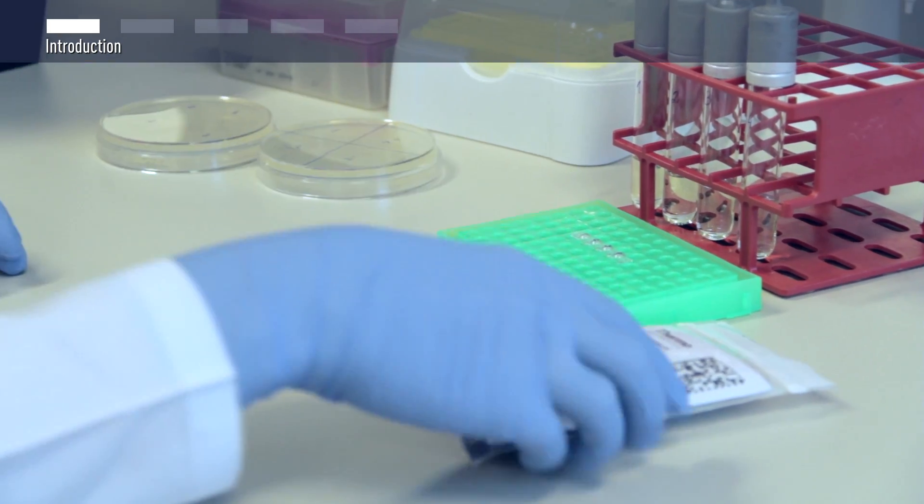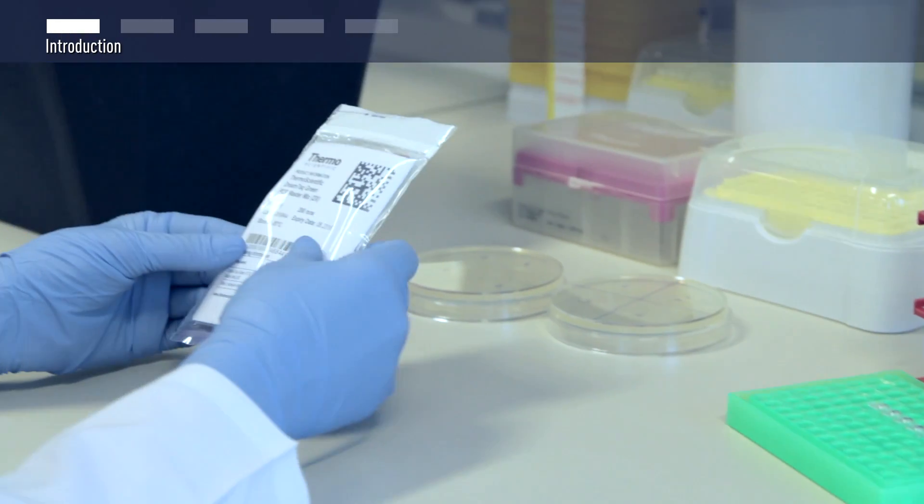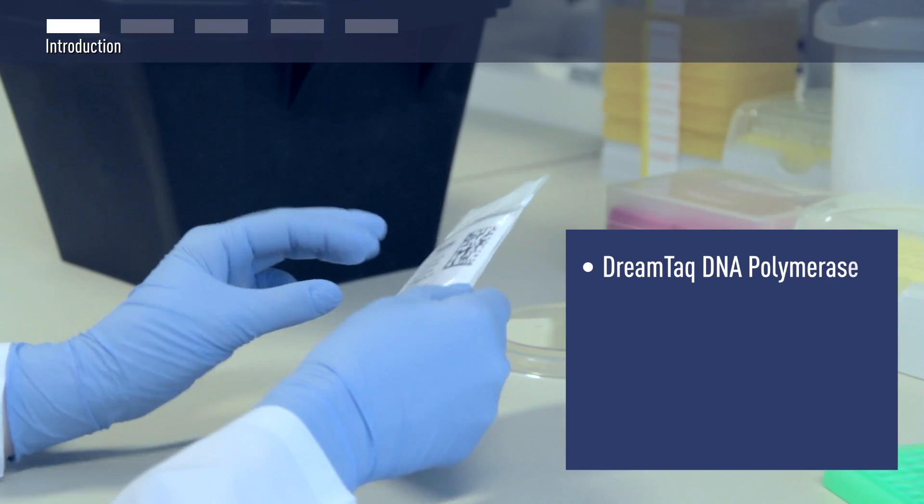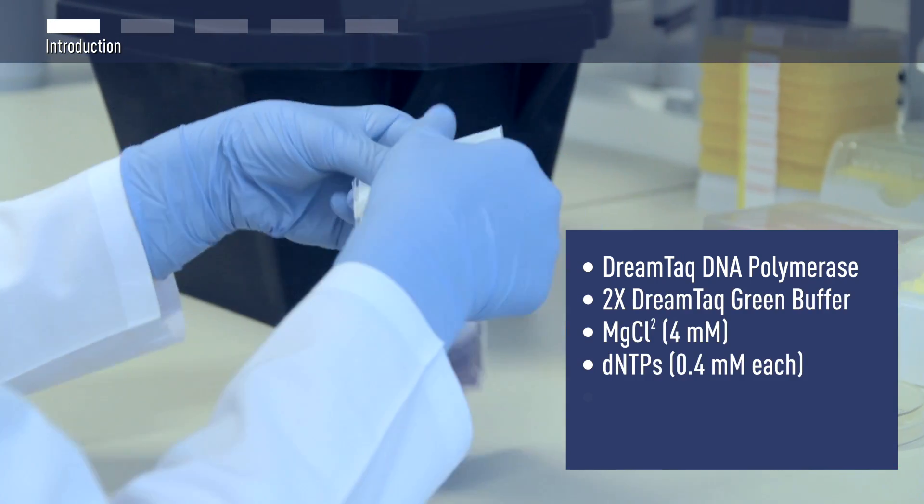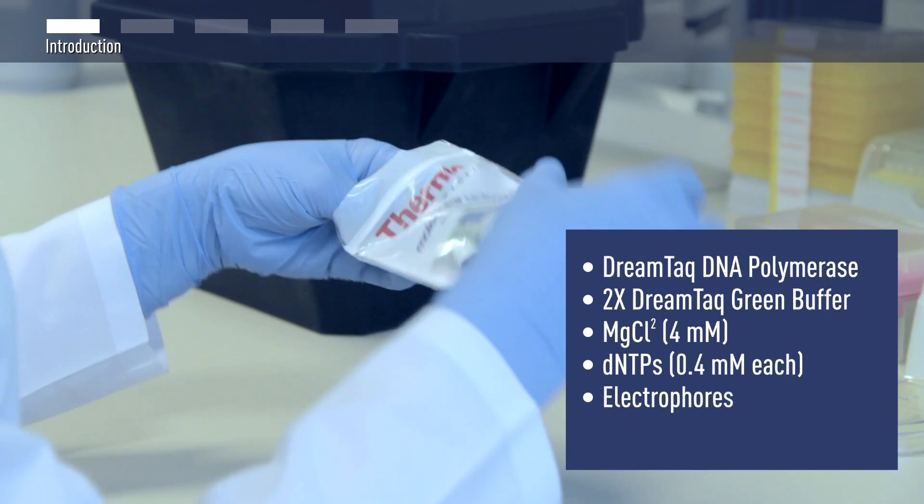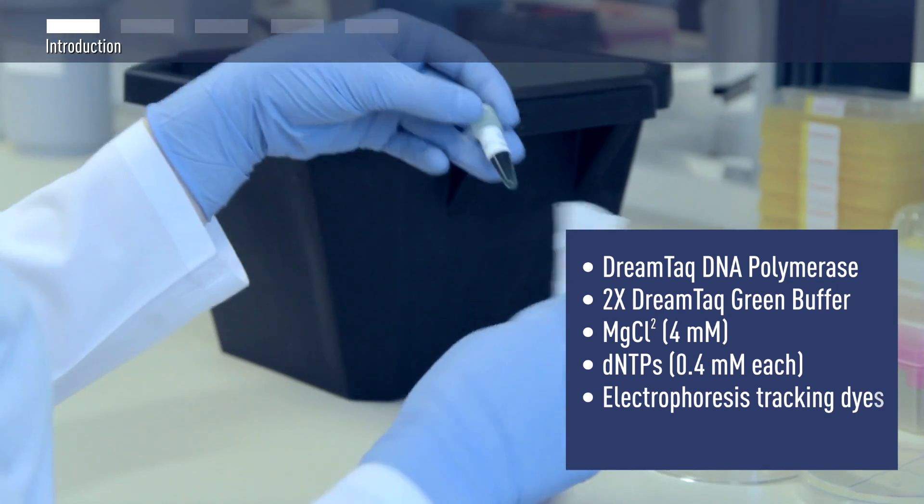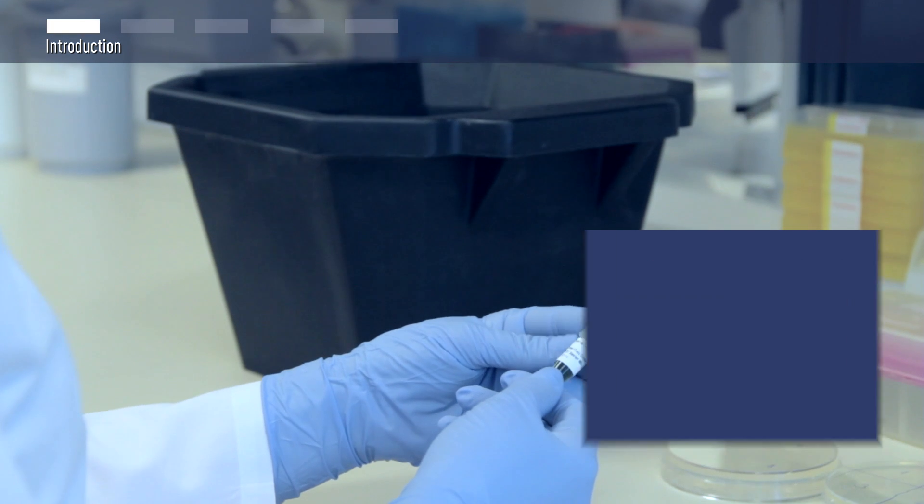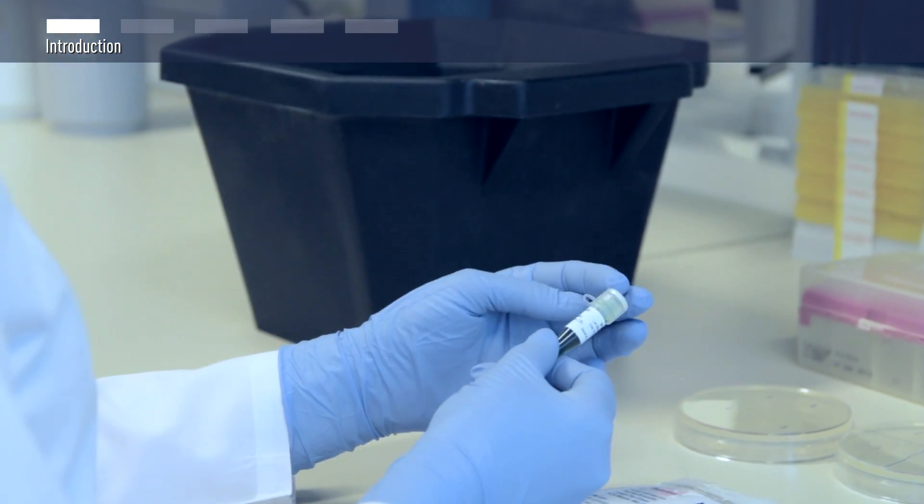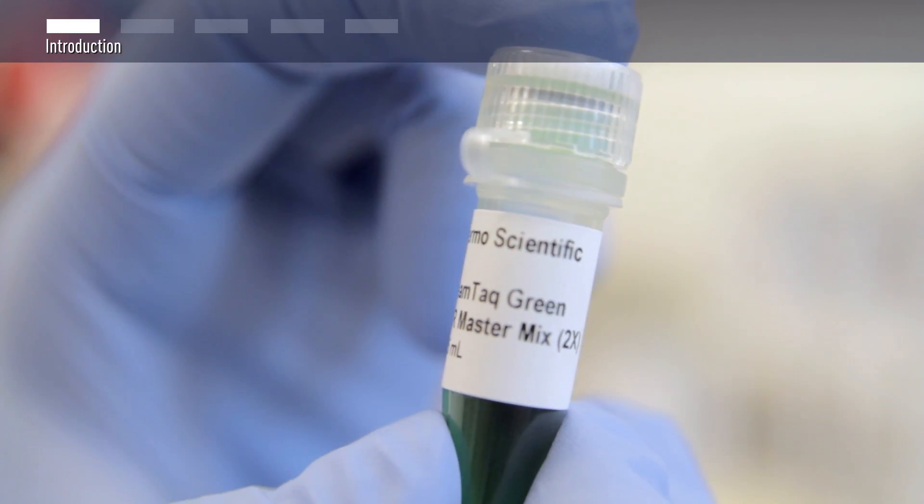DreamTaq Green PCR MasterMix contains everything you need to perform PCR except for gene-specific primers and template DNA. The MasterMix is green because it includes two electrophoresis tracking dyes and a density reagent. This enables direct loading of PCR products on gels after PCR amplification.